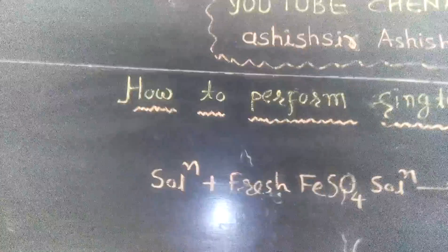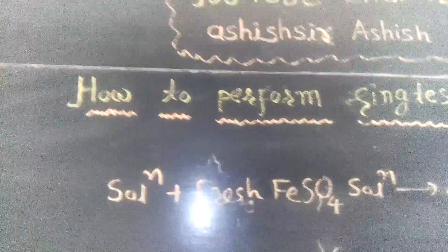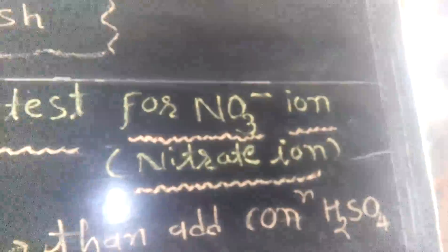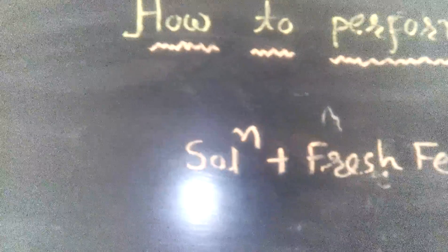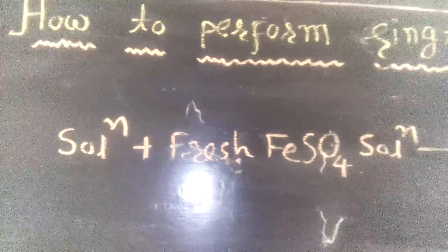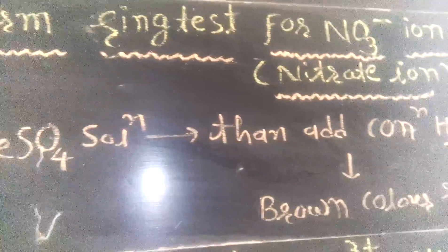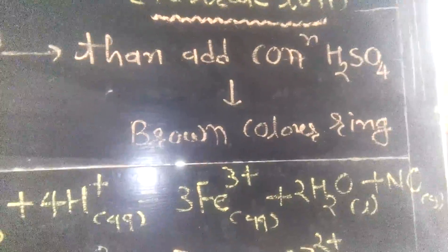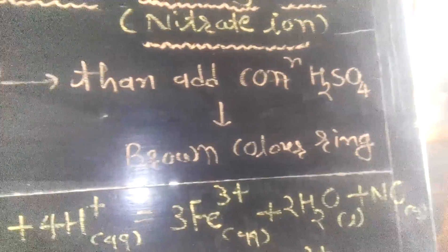We are performing the ring test — how to perform the ring test for nitrate ion in the laboratory. First, take a solution containing nitrate ion and add freshly prepared ferrous sulfate solution. Then add concentrated sulfuric acid; a brown color ring is produced, which is the confirmative test of nitrate ion.